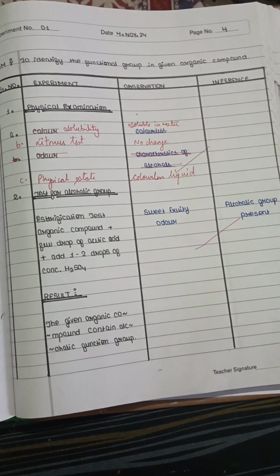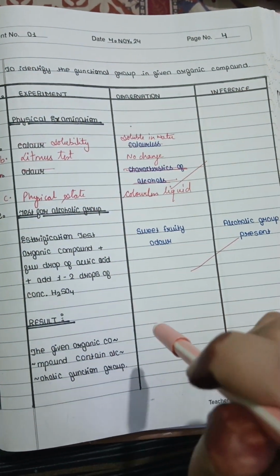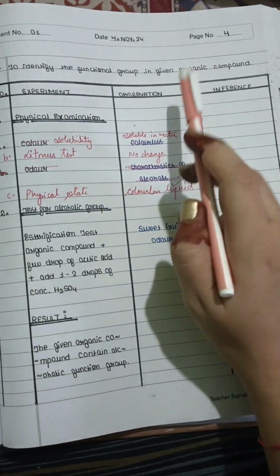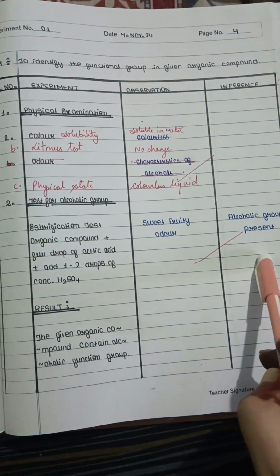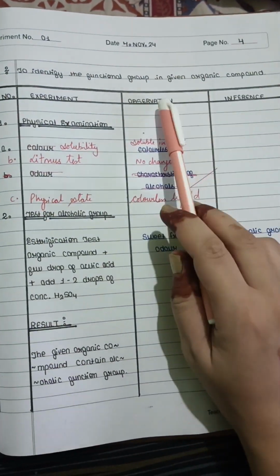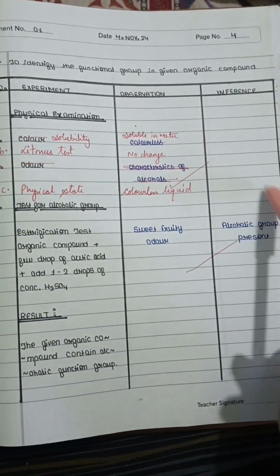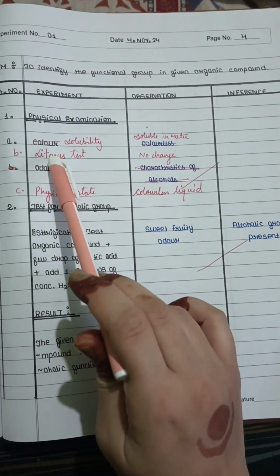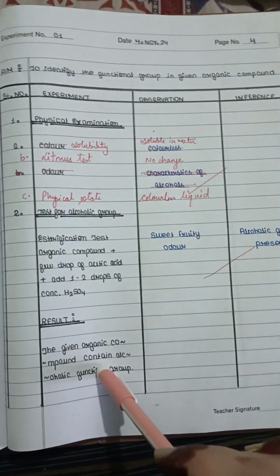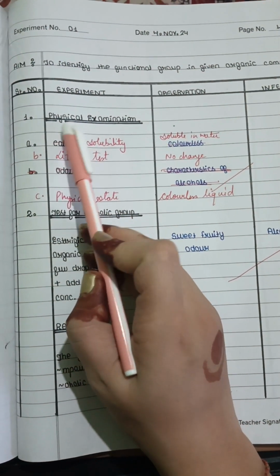ठीक है तो शुरू करते हैं. The first thing we are going to see today is how you are going to write your organic compound testing. You have your experiment, and you're going to make three tables: experiment, observation, inference. Okay, inference means the conclusion you took out of it. Observation is what you saw when you performed the experiment, and experiment is what you are going to perform in your lab. Okay, so the first testing is physical testing.